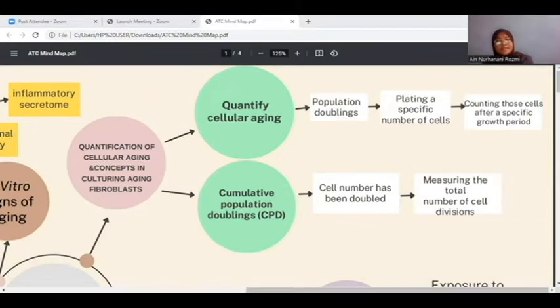So, senescent cultures are those that fail to reach confluence after a week. When cultures are unable to complete one population doubling over the course of a 4-week period that includes 3 consecutive weeks of refeeding with a new medium containing 10% FBS, they are deemed to be senescent at the end of their replicative lifespan.